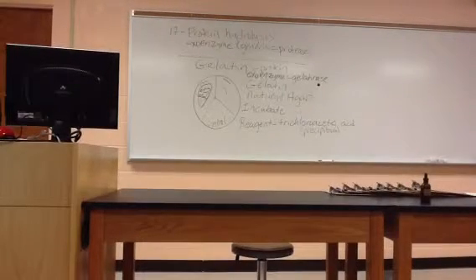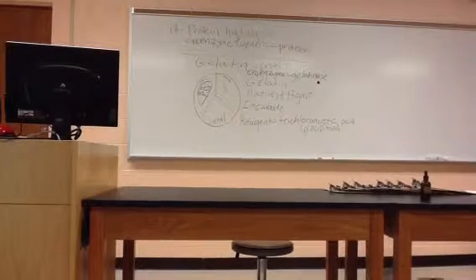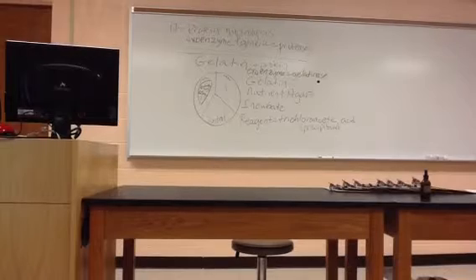Okay, this one's in your photographic atlas, page 73, the gelatin test. So if you want to look it up later, just write it down, page 73 as a gelatin test.